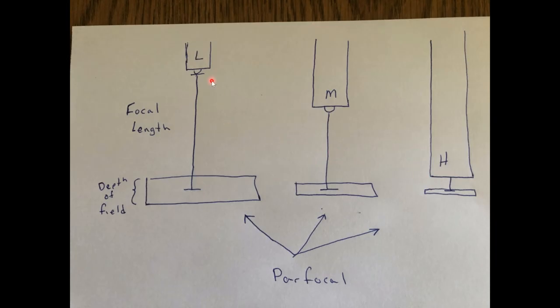The microscope is set up to be what's called parfocal. Boy, I just can't even imagine trying to use a microscope that wasn't set up this way. The early microscopists, and I'll talk about microscopy and the history of that in the lecture when we get to the cell chapter. But you'll notice that even though the focal lengths are different distances away from the lens, it's set up so that the area that's in focus is all the same place.